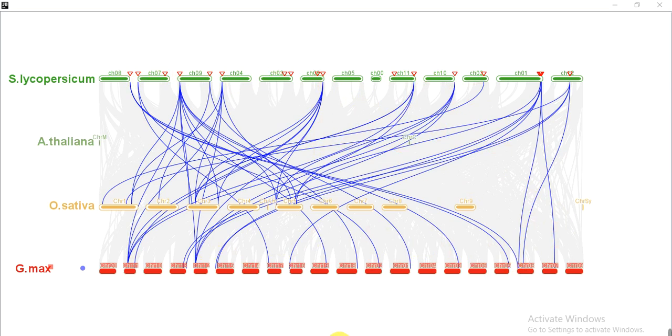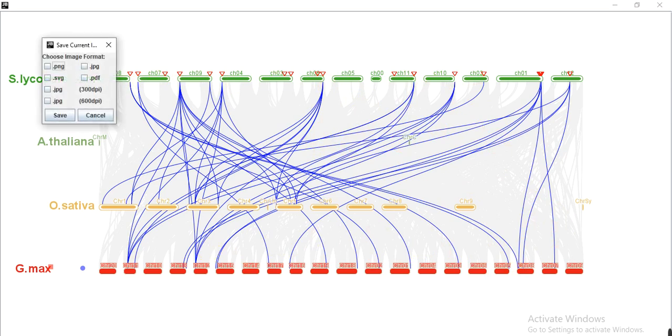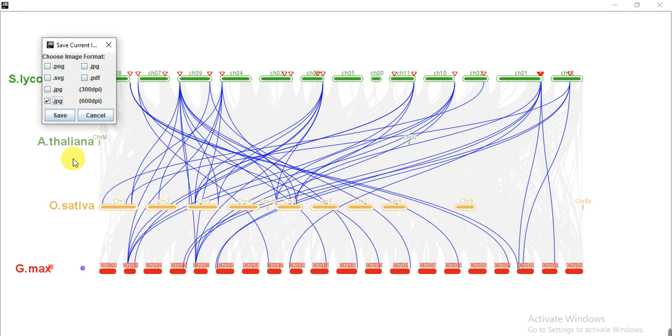Then click save graph and select JPG format. You can then use this into your manuscript or your dissertation. So in this way you can prepare this synteny or collinearity analysis of multiple species to study your gene family.